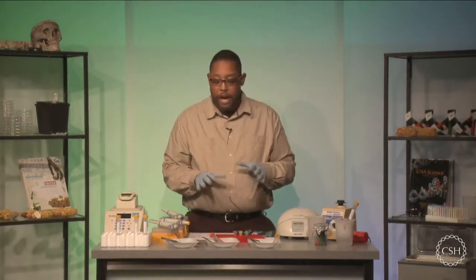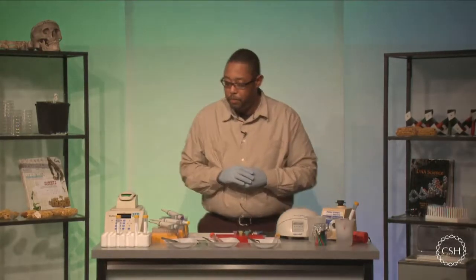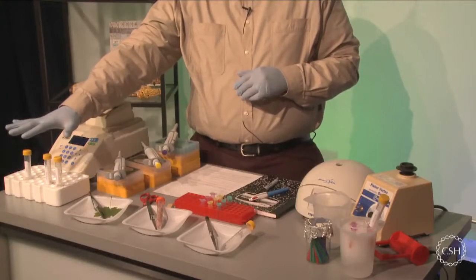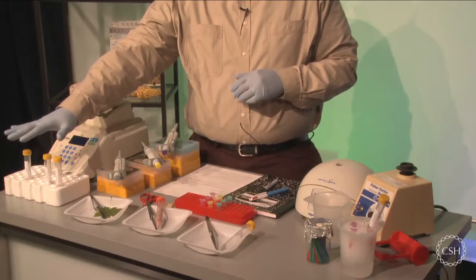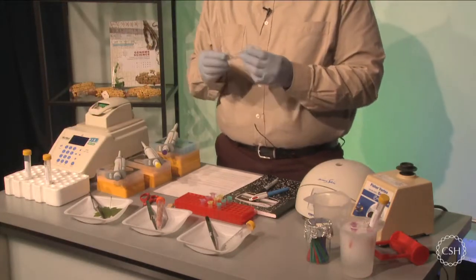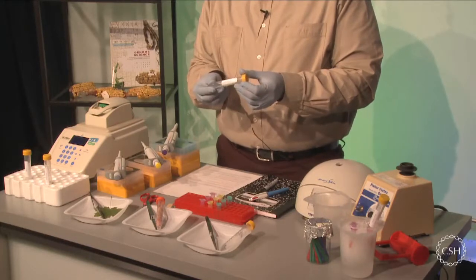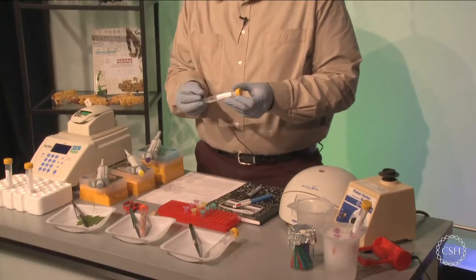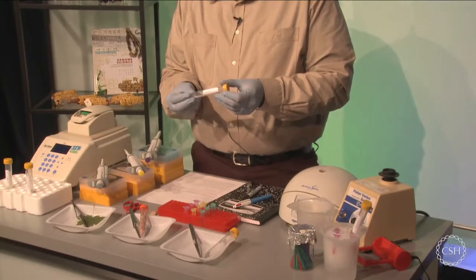Okay, now let's get to the immediate things that we need. We're going to need some reagents. So I have a set of reagents over here that I'm physically going to need. This is going to comprise of lysis solution. So I have my lysis solution, which is actually going to help break up the membrane and release the contents of my physical DNA. Okay.